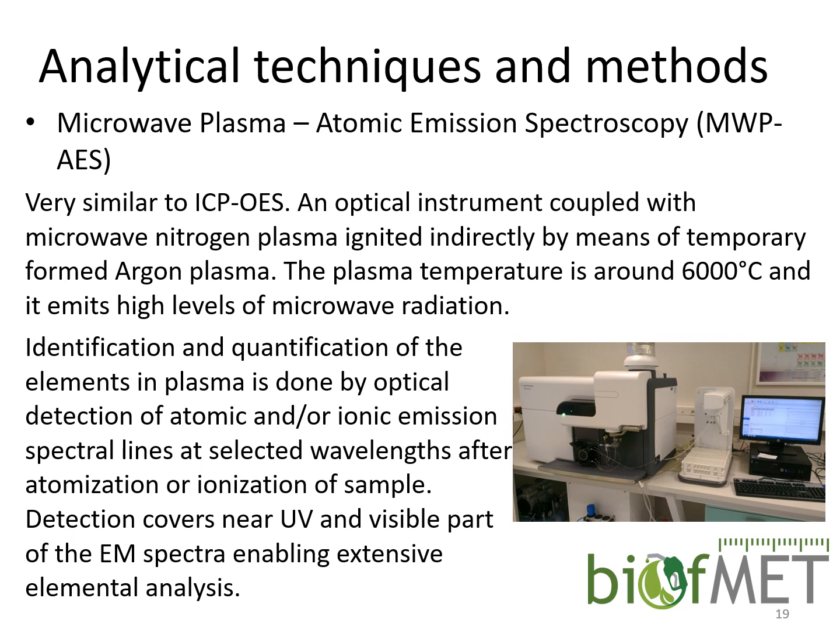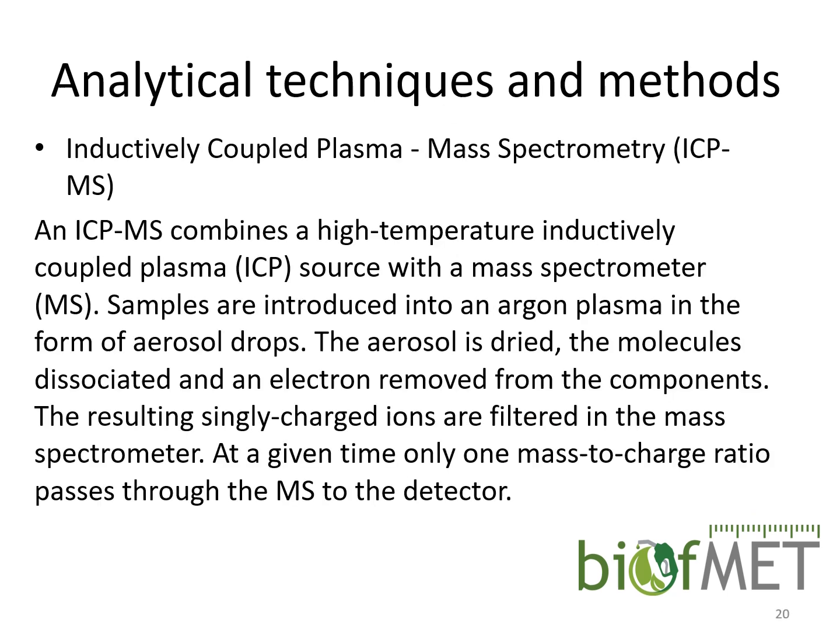You are also recording emission spectra, and all other principles are the same. So you need to have your sample in liquid form that can be further vaporized and atomized, and for some elements even ionized in plasma, so that emission spectra can be detected. It also allows you to determine more than one element from the same sample at a time.